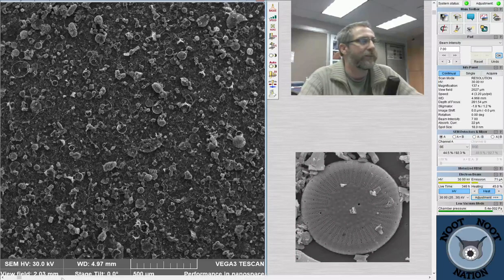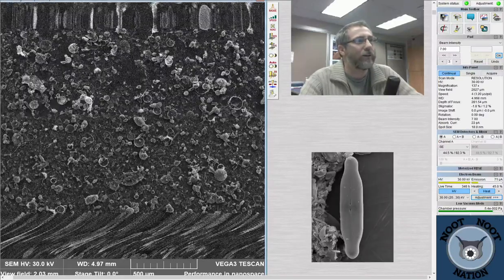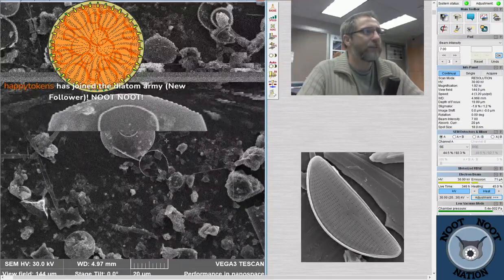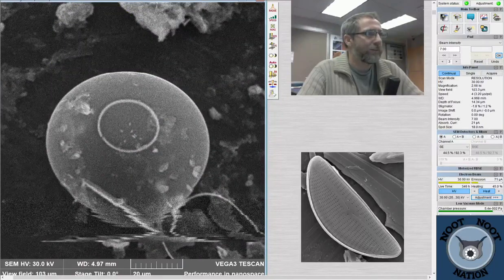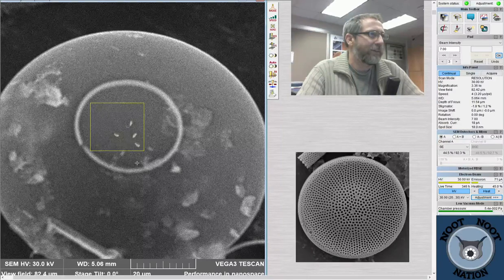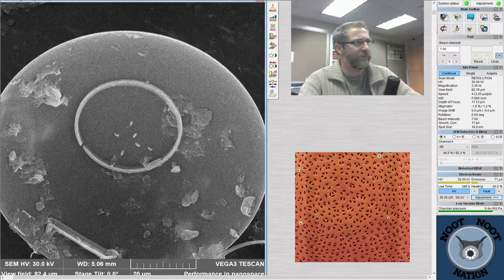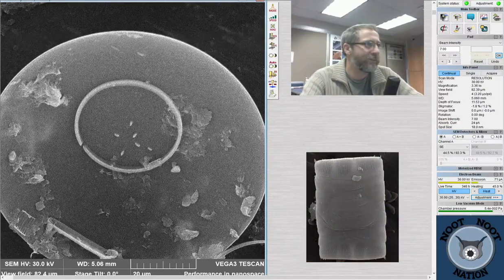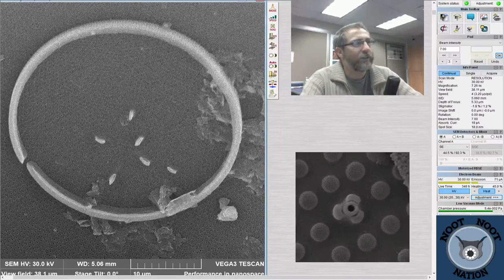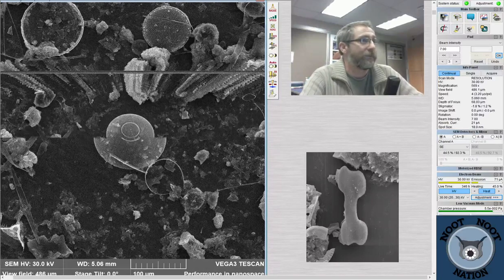Just to give you a sense of how things work inside the scanning electron microscope and what you're looking at on the actual samples, everything that we're looking at here is just dust-sized particles. They're super small. And, oh, cool, Melosira. This is a Melosira, a type of diatom that occurs in the winter time, I guess, in San Francisco Bay. I can identify it very quickly because it has this structure. Now, maybe that's actually not a Melosira. Maybe that's just a girdle band. And these are something else, because that's the inside of the diatom, and that should be on the outside if it were Melosira. Oh yeah, it's just an asymmetric landing on the surface of whatever this thing is, which could be Melosira, but may not be.